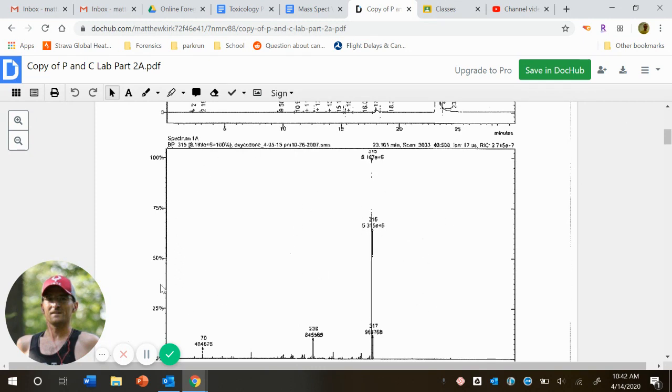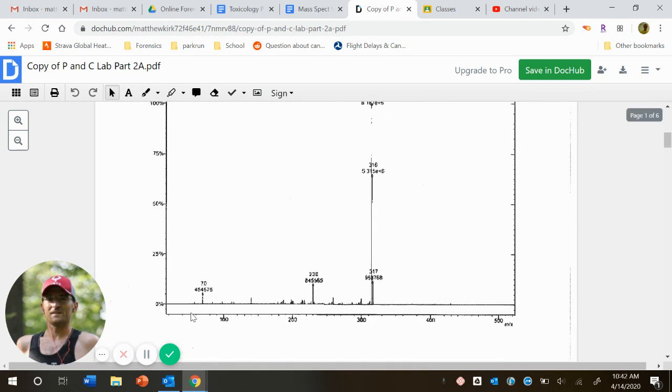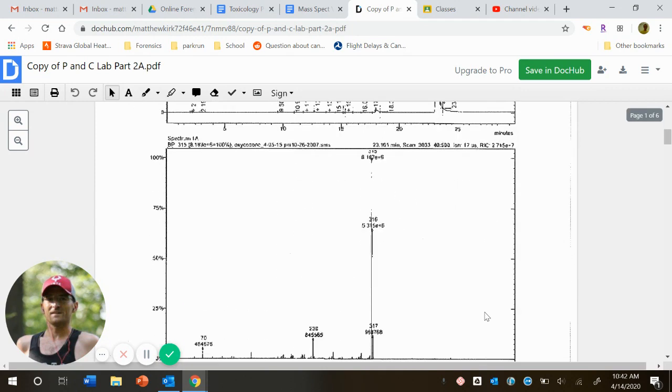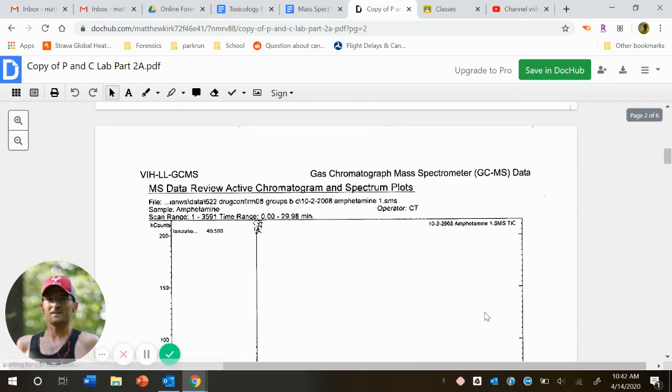Again, y we could think of as count or intensity, or even abundance. And x is, it's mass over charge, but really let's just think of the x-axis as mass. So again, and that's how it is for all of these.